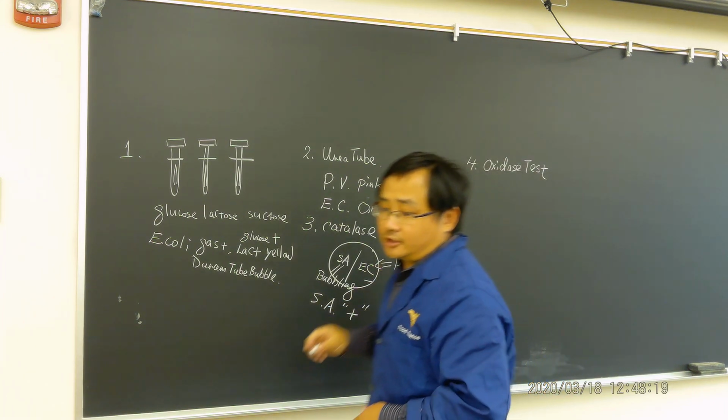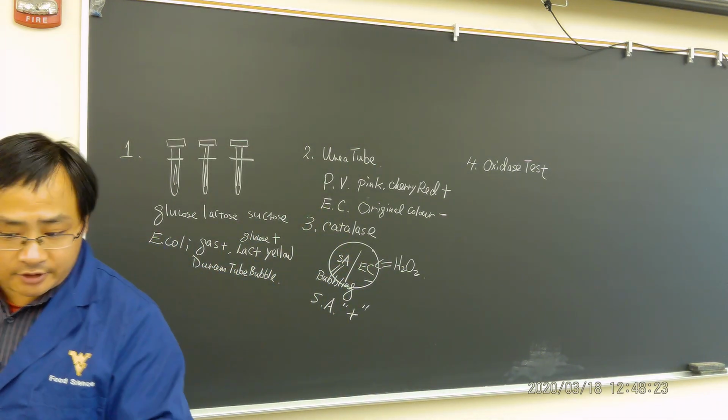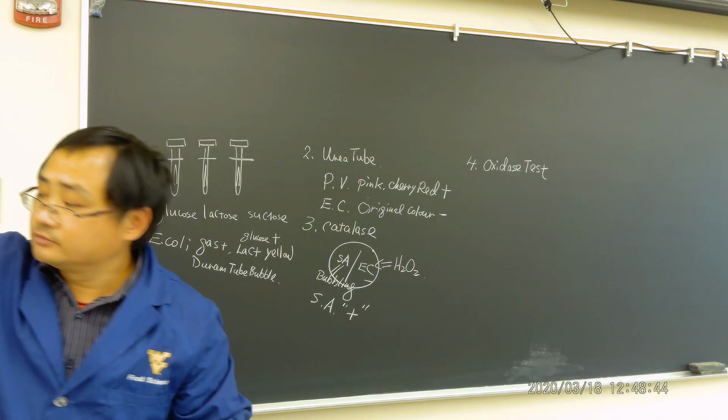So, oxidase test, let's do that. Karen, can you do it like this? We have only 2, so I want to save a little bit. Just 2 of them share one place, you put 1 drop. And Lee, if possible, you can do the other side. Just put one drop there. Let's use that one. 2 of you can share one, and just 1 drop.